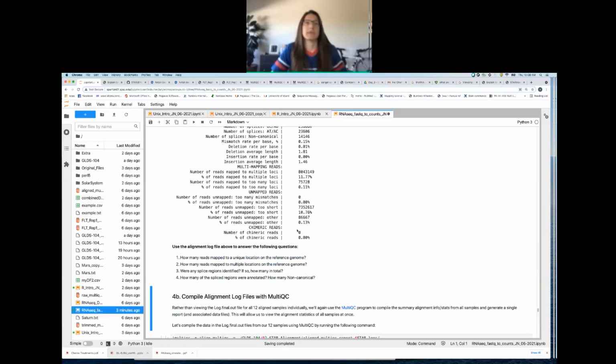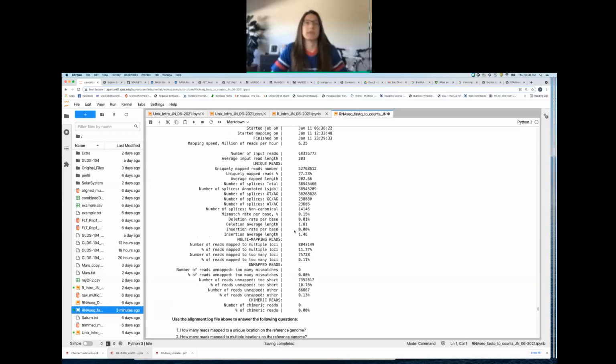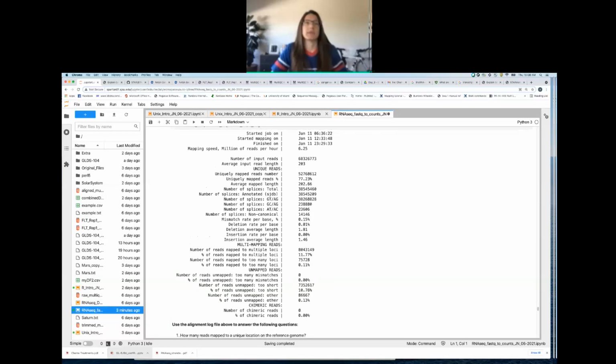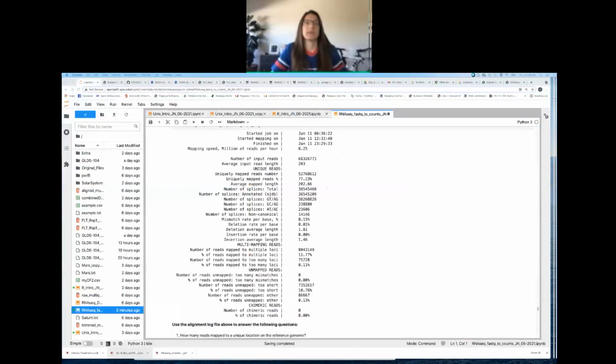Okay, so now I want you guys to take a look at this Log.final.out file, and we're going to answer some questions. I have my questions pulled up in a separate file, so that way I can leave this up for you guys to take a look at. The first question I have for you guys is how many reads map to a unique location on the reference genome? You could put this as either a percent or the full number or both.